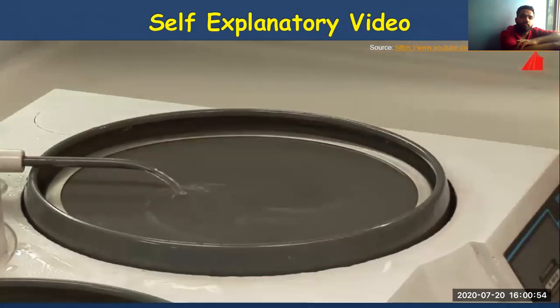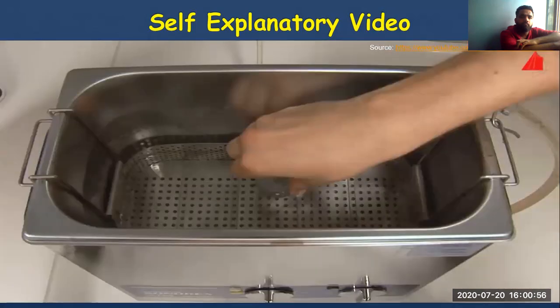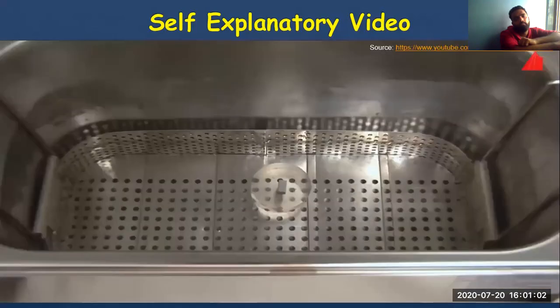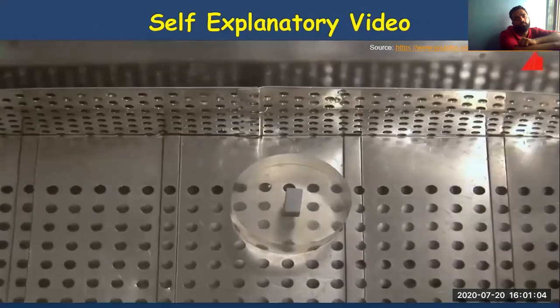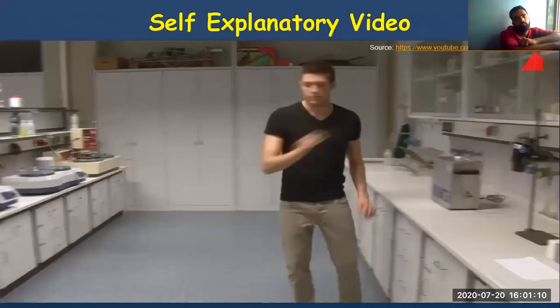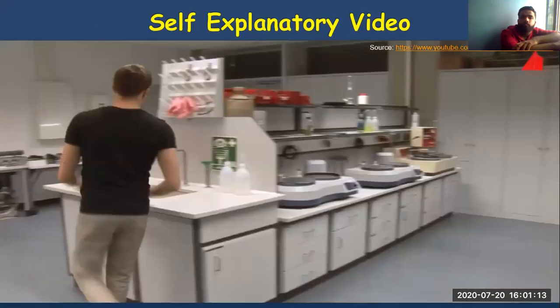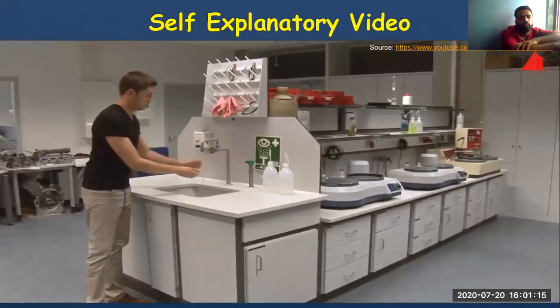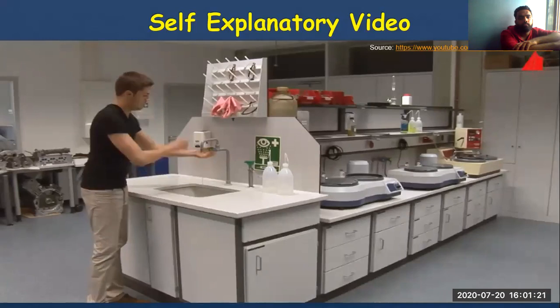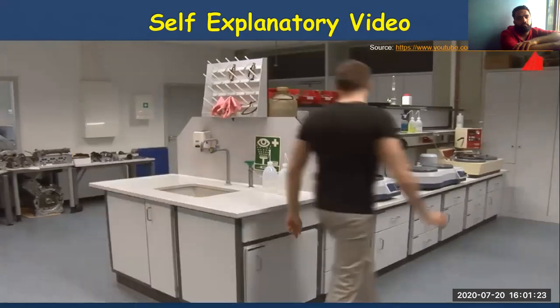An absolute prerequisite for polishing is a thoroughly clean specimen. The ultrasonic bath and running water help to remove any residue from the ground surface. Otherwise, hard particles might be pressed into the polishing cloth and scratch the surface. Hands should be washed as well, so that no unwanted particles find their way to the sample and the polishing cloth. Now the material tester can start with the first polishing operation.